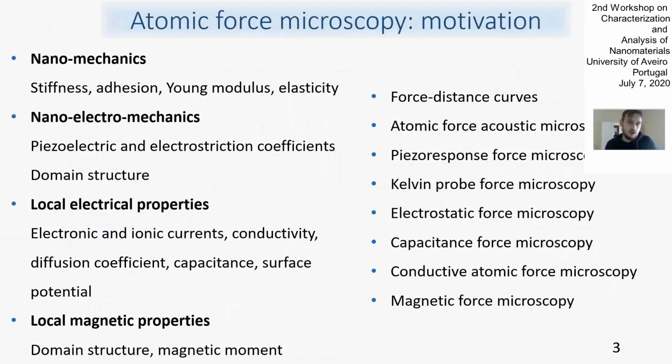So, what is the motivation to use atomic force microscopy? The motivation is that we want to know the properties of the material at the nanoscale.